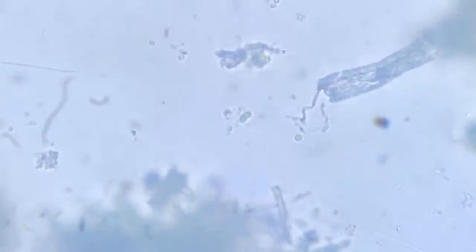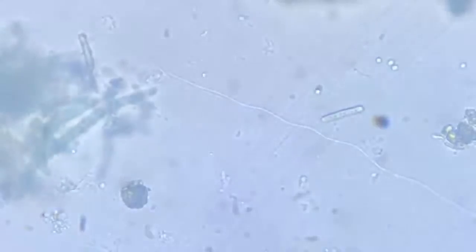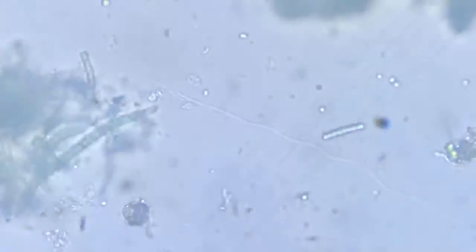And I'm sharing something that I had shared yesterday. You can see a straight, noodle-like worm at the lower end of the screen, and there is another one at the top end. Here is the top one, and there is one at the lower end. Now, these are unique things that I had never seen before.